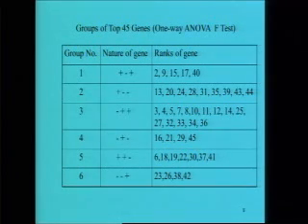The genes with ranks 13, 20, 24 and so on are such that they are expressed at a higher level in the non-obese group and at more or less the same level in the other 2 groups. So this table is the most important summary of our analysis. This we can do for many more genes, and these genes are further investigated. One can verify the results of these inference procedures by some other techniques also.